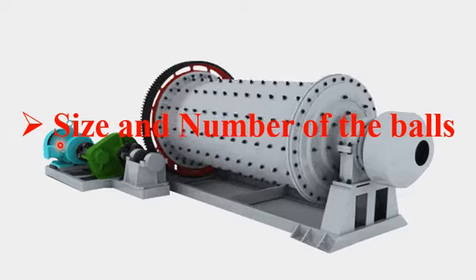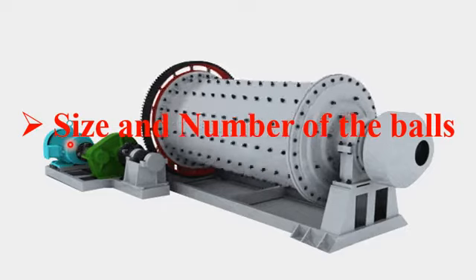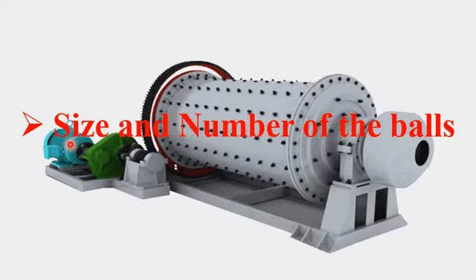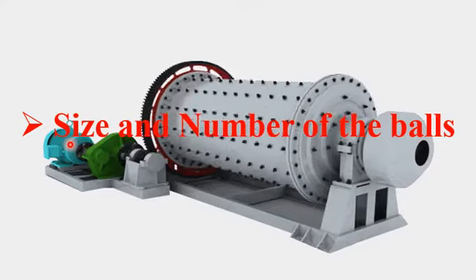Please note that using balls with a larger size will cause a larger amount of power consumption. So larger balls in the ball milling process use too much power.